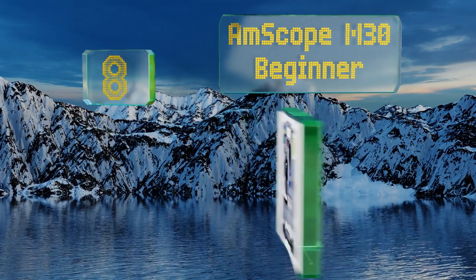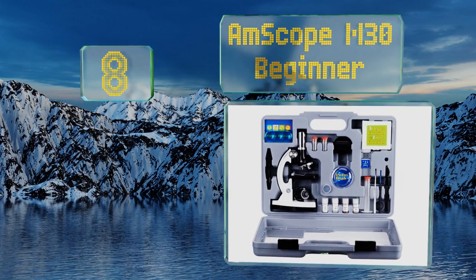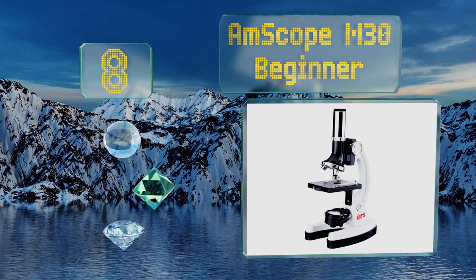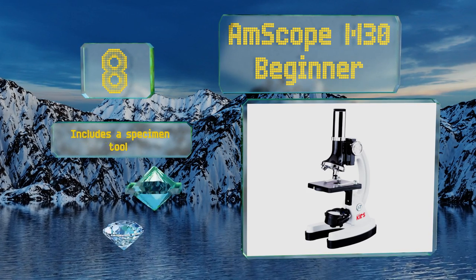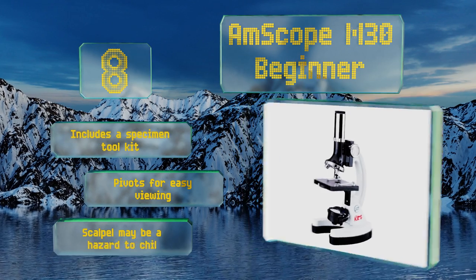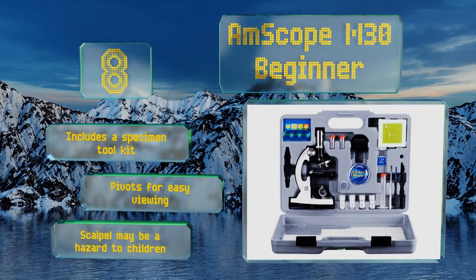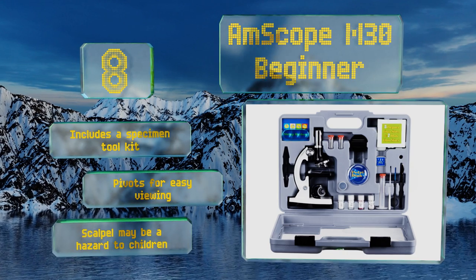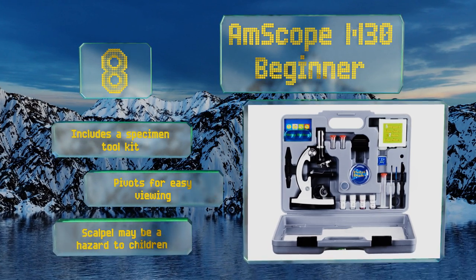Coming in at number 8, the hard-sided ABS plastic case that comes with the AmScope M30 Beginner effectively houses the entirety of your kit, from stains and slides to the scope itself. It's a good bridge model between units intended for preschoolers or kindergartners and much nicer options. It includes a specimen tool kit and pivots for easy viewing; however, note that the included scalpel may be a hazard to children.